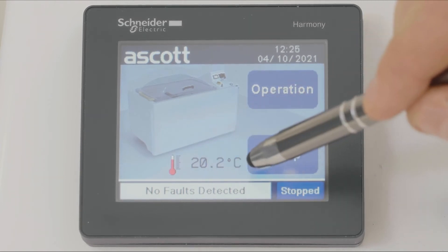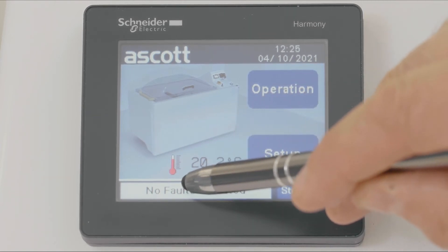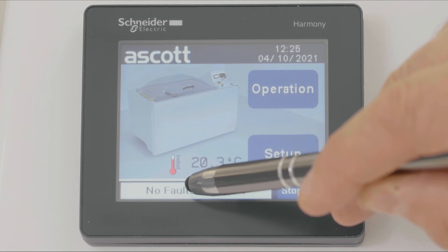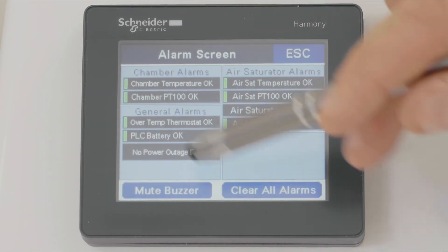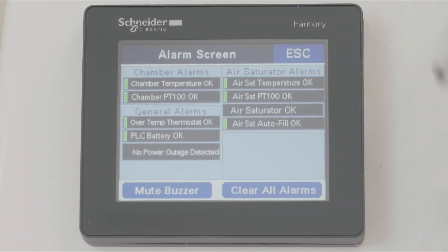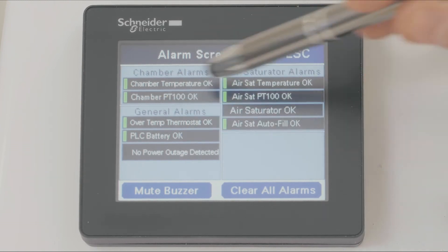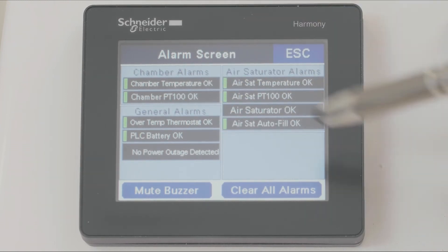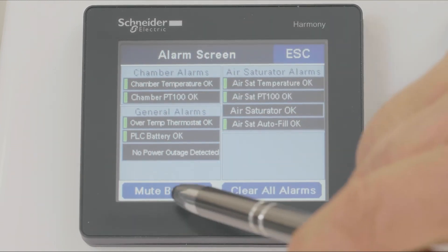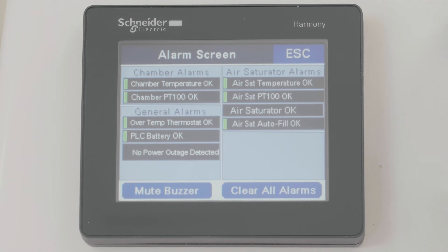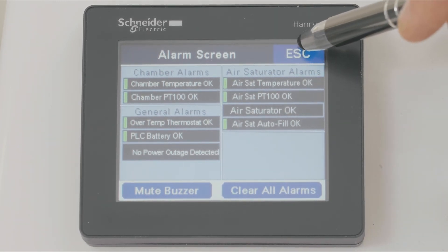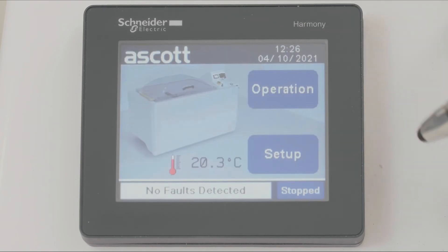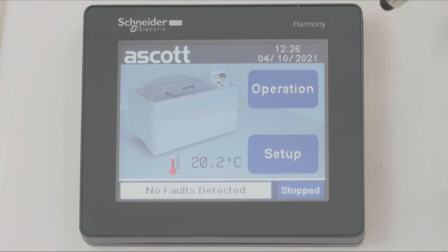Also from this page, if we go to the bottom of the screen and press the fault indicator, this takes us to our alarm page where we can see the status of the chamber. At the moment everything is good, but here we have a mute buzzer and a clear all alarms button. We press escape.